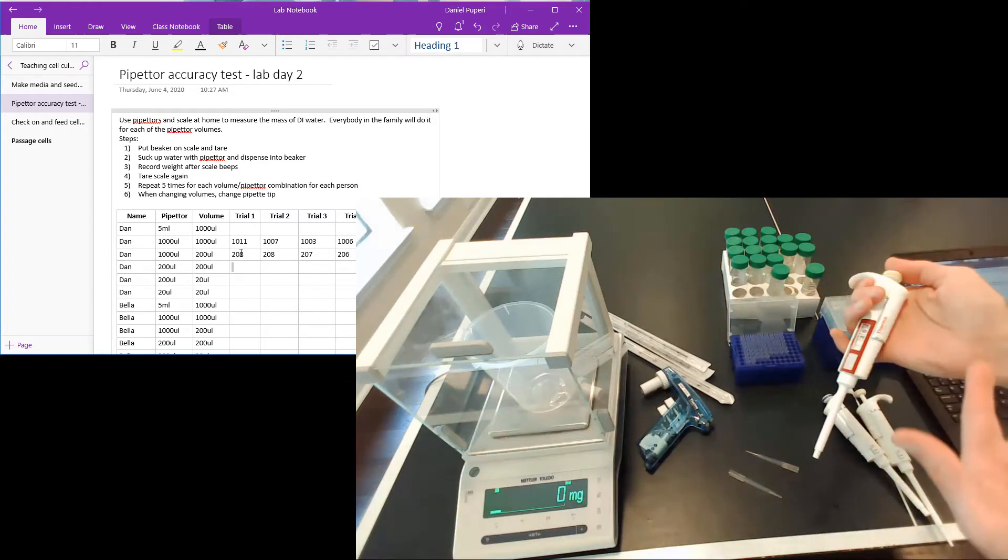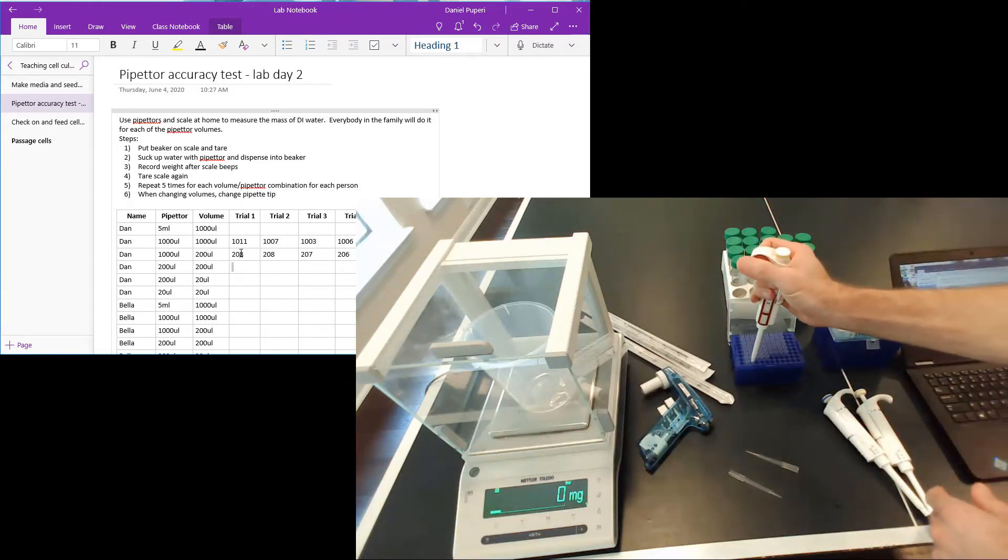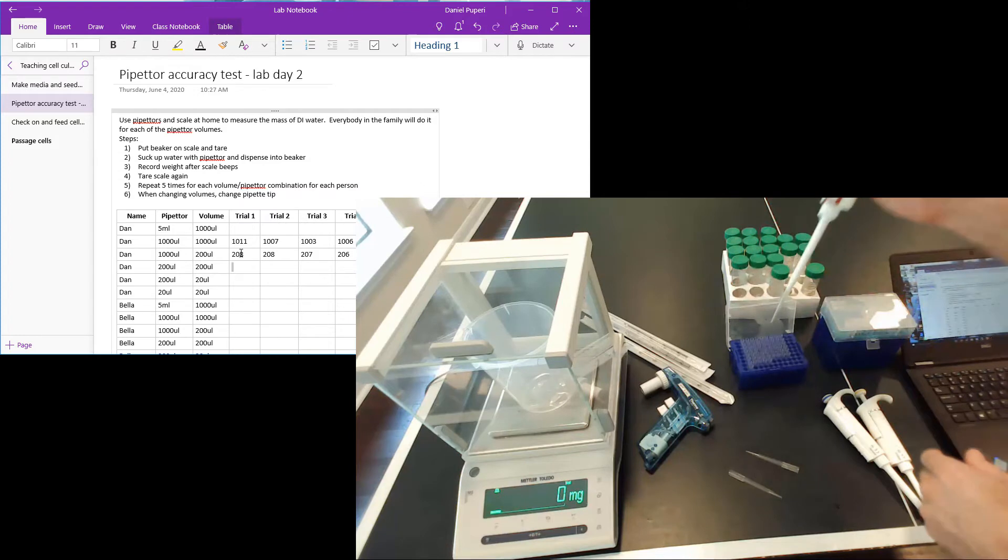I already have this one set at 20, so I'm just going to start with the 200 microliter measuring 20.